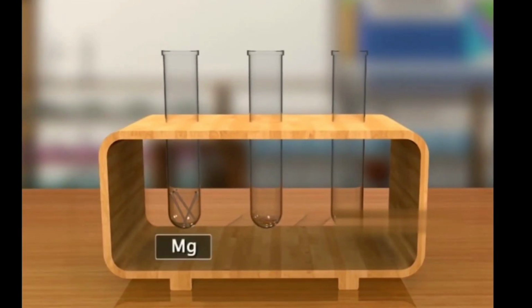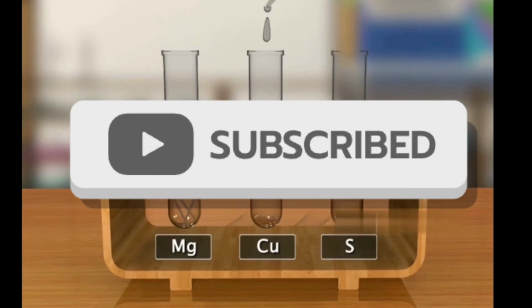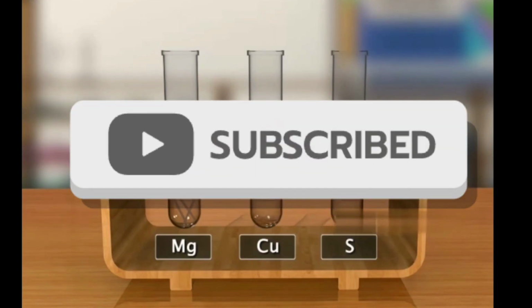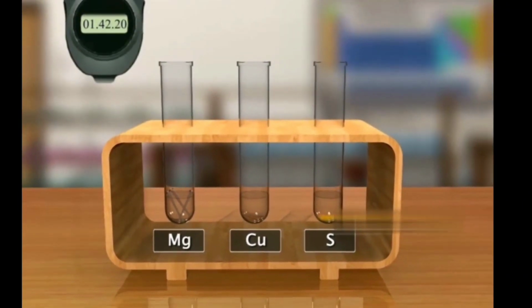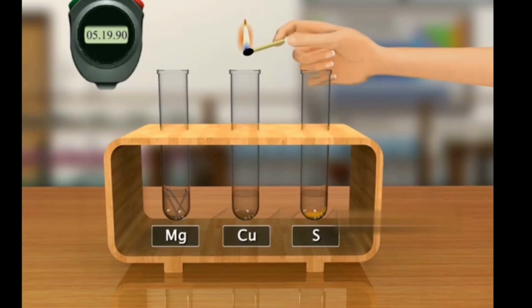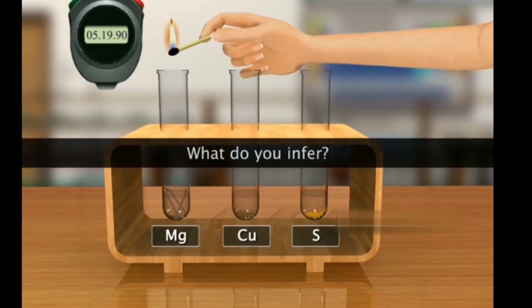Take magnesium, copper and sulfur powder in different test tubes. Add 5 ml of dilute hydrochloric acid to each of the test tubes. After a few minutes, bring a burning matchstick near the mouth of each test tube. What is your inference from this experiment?